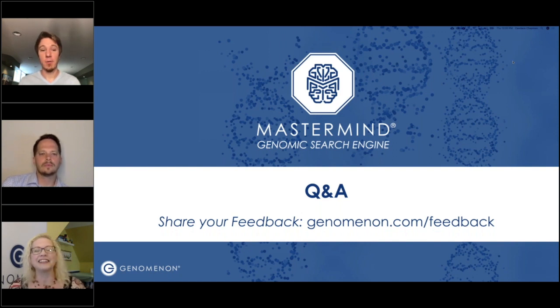I would also like to mention, if anyone is interested in the API or how the API might be able to help automate your processes, particularly getting into additional things that we didn't fully go into, like how you can use ACMG classification in the API, please feel free to reach out to us. We also have a live demo of the API on Mastermind. In the upper right corner, there's a link that says API. Anyone who has an account can go to that link and try the Mastermind API out right in the page there. So I encourage you to reach out. And there are some great tutorials on the tutorials page on the website, including webinars on the webinar page. There's one about ACMG from back when we first released it.